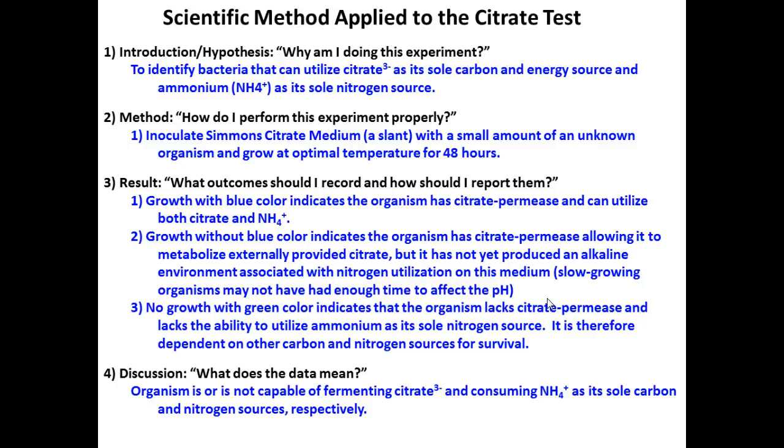Okay, so sometimes you'll get a false positive thinking that it grew when in fact you had no growth at all. We took care of the slow growers by the fact that we've let this go for a long time, so they should have had enough time to produce that blue color. So no growth with green color indicates they died. They weren't able to survive. They are negative for this test.